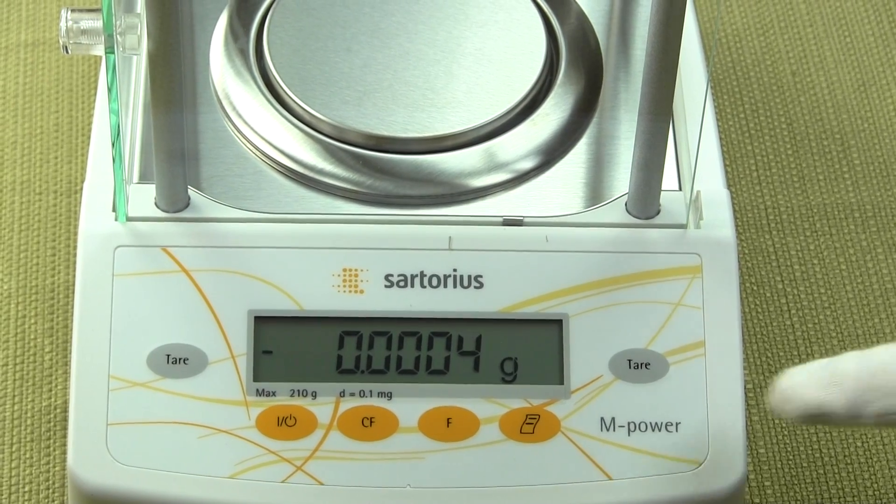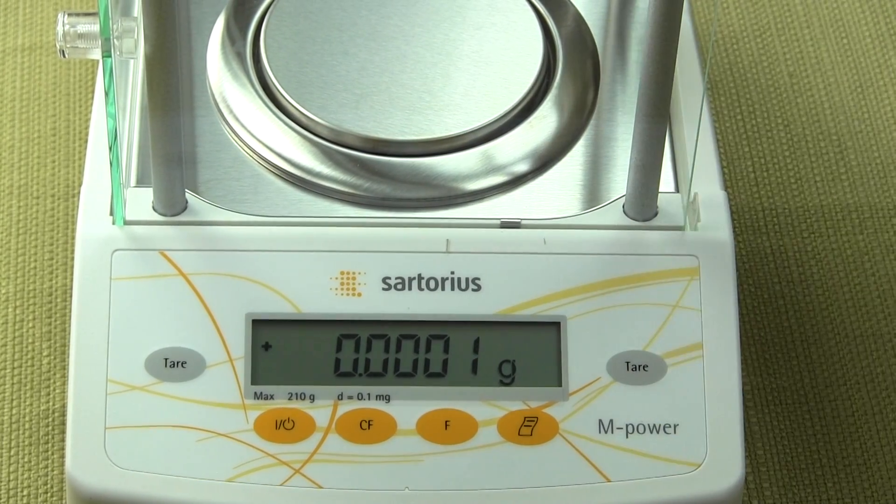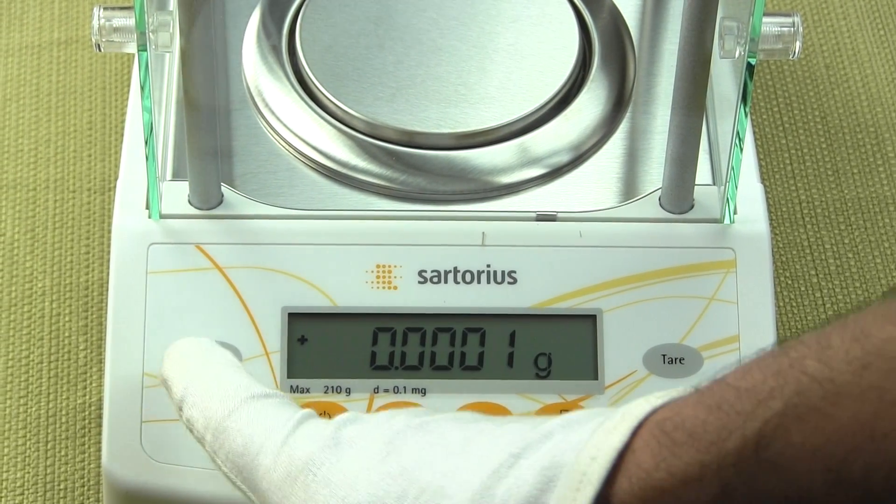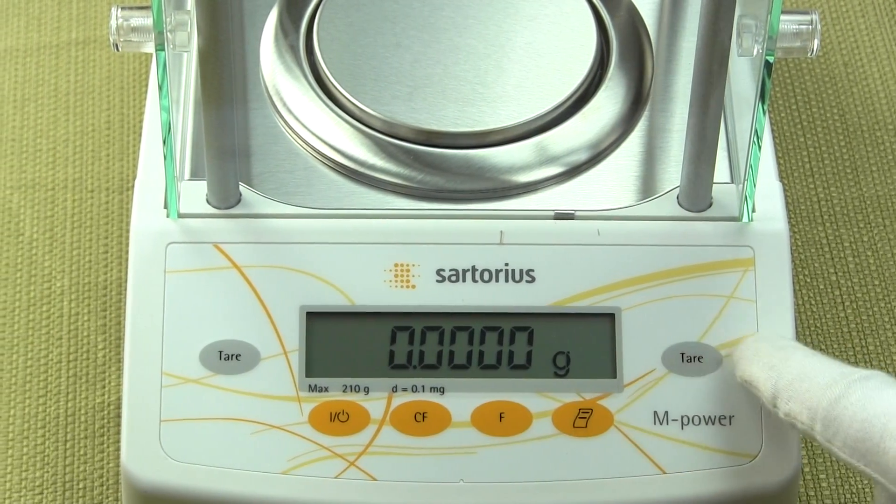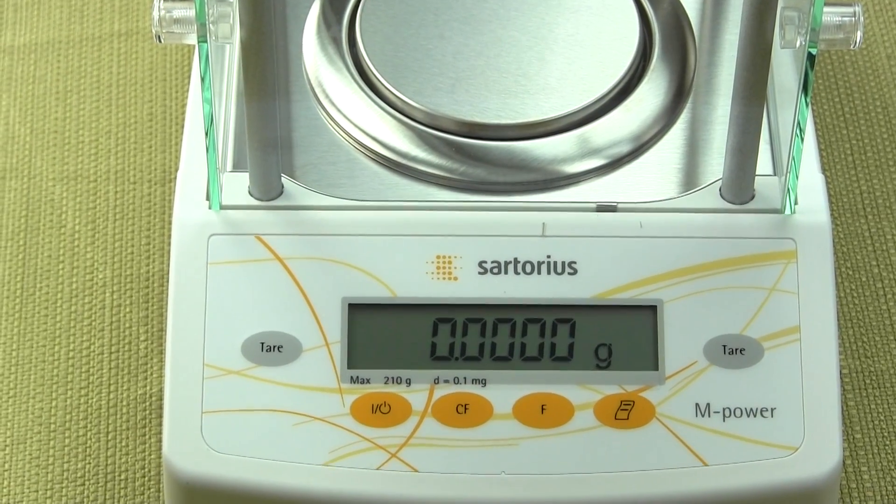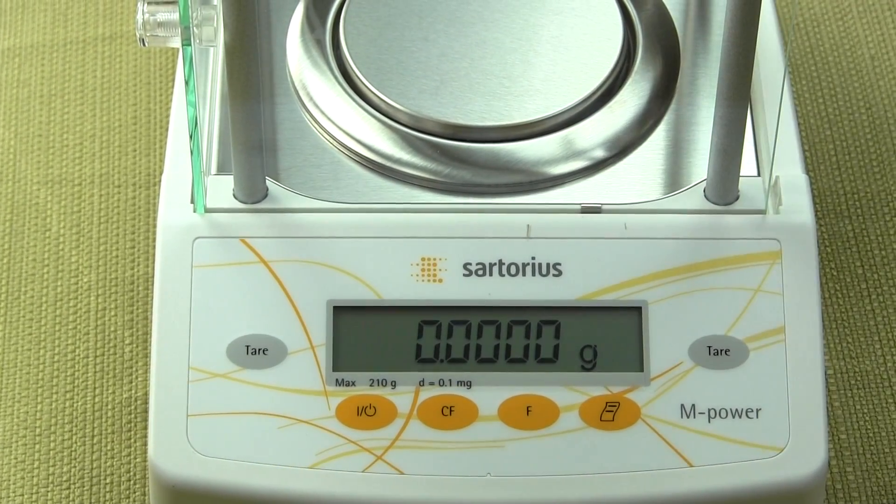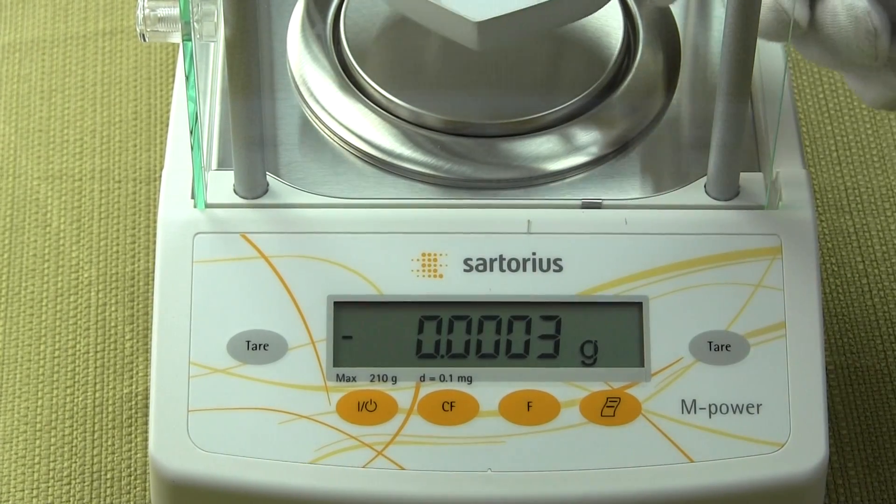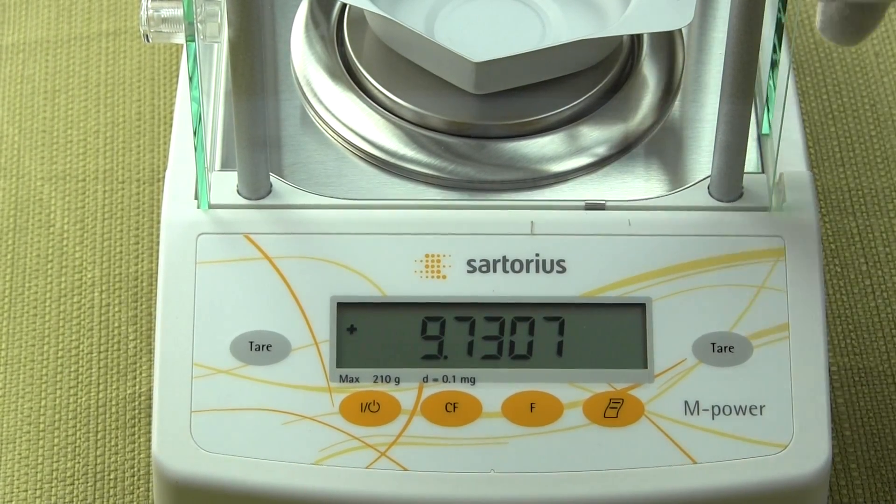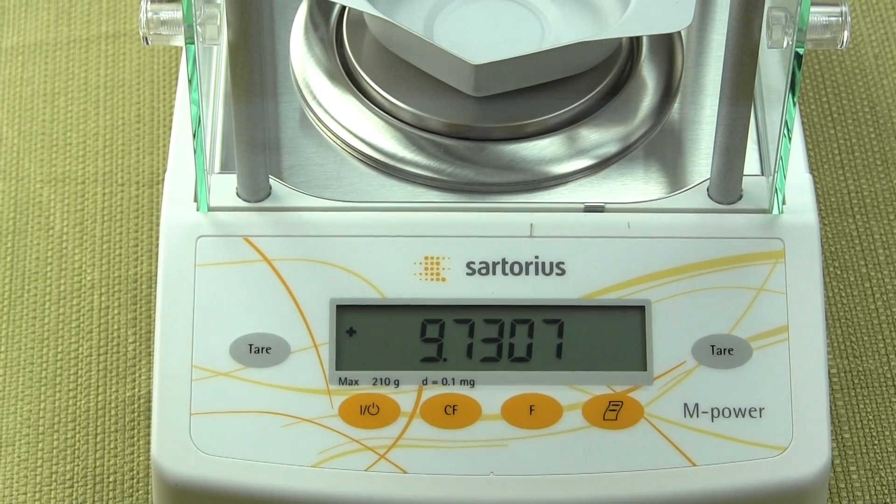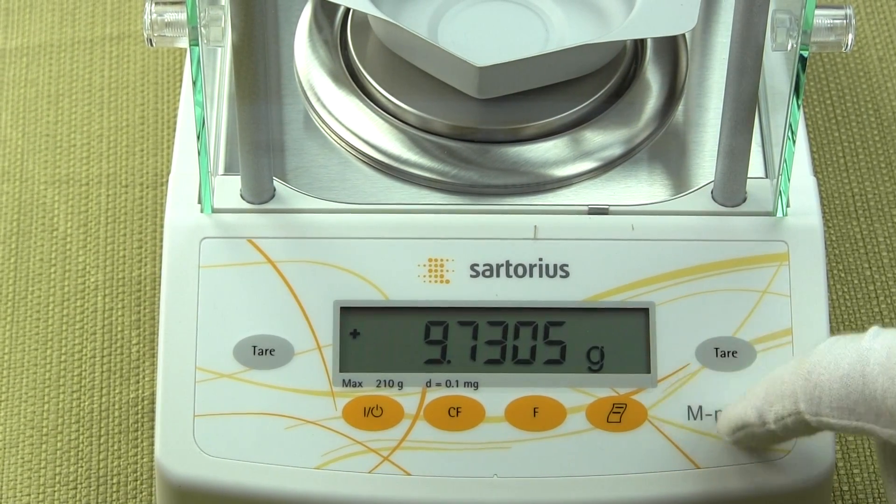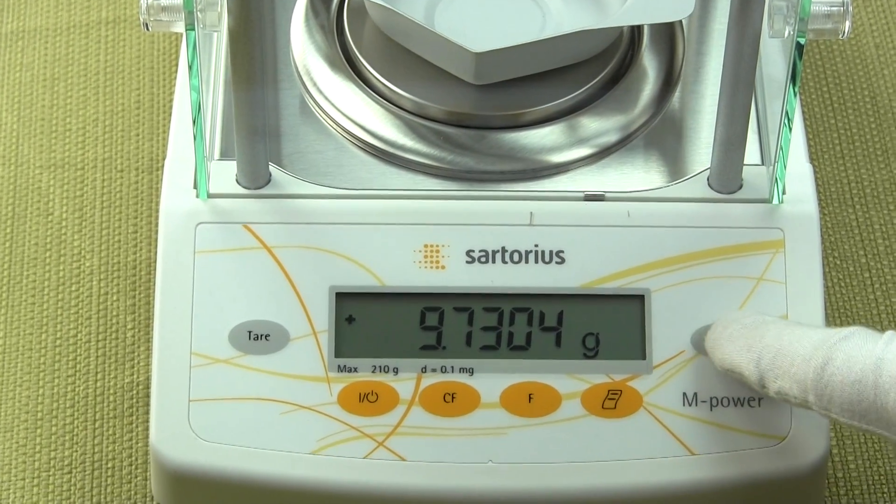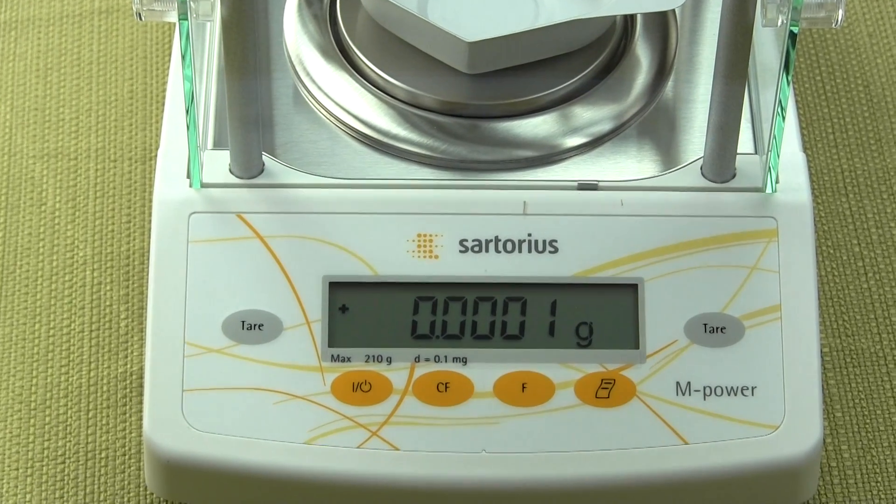Let's go over a few more of the features and how simple it is to use the balance. You'll notice with this balance we have two tare buttons, one on the right and one on the left. If we were to put an item on, for example, we sell these weigh dishes that are very nice because they're lightweight. You can put that on the balance and you could tare it out. You just simply hit the tare button and I can do it either on the right or the left hand side.